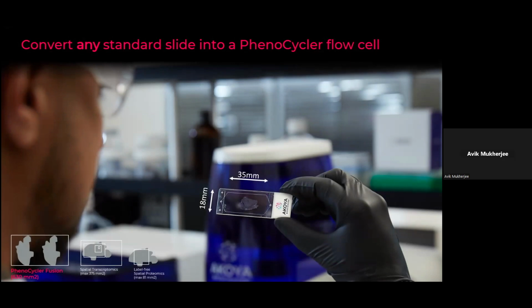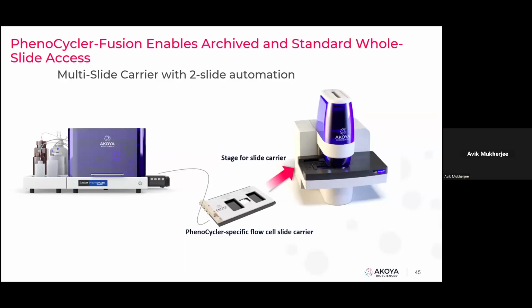And this is the input through these holes. The fluid is going to flow. And this is the imaging area that you have for this study. And then this slide goes on to the PhenoCycler-specific slide carrier, which goes into the imager. And when you click run, now the process is automated.